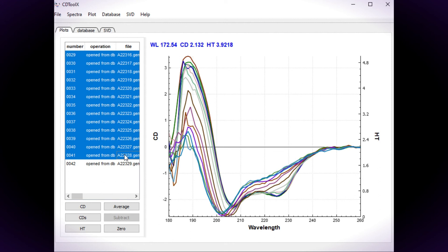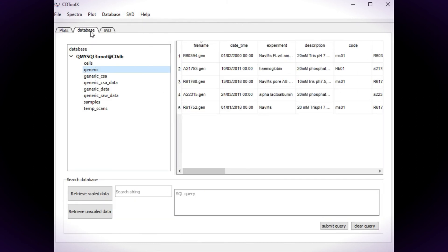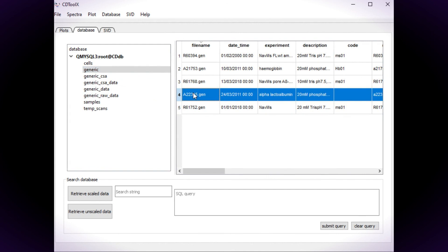Select the data and choose Add Temperature Scans. Although the table is called Temperature Scans, any data series can be entered. The first spectrum in the list will be added to the generic table as a representative of the data series.